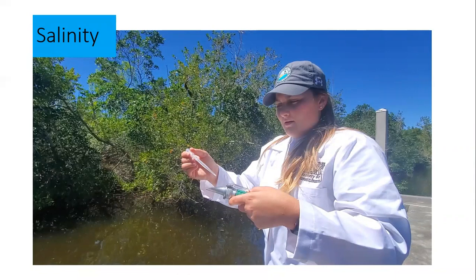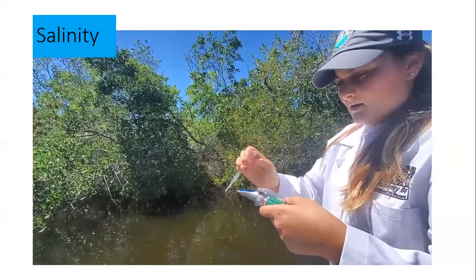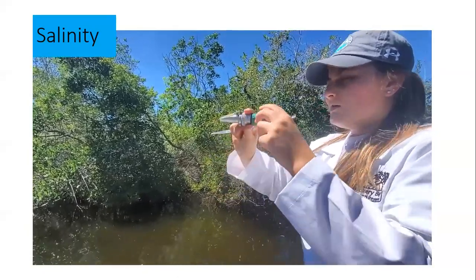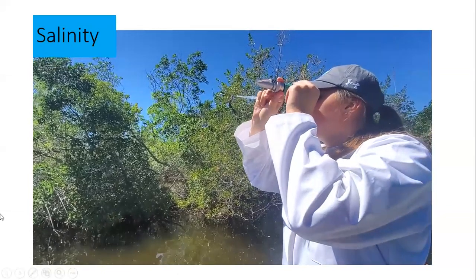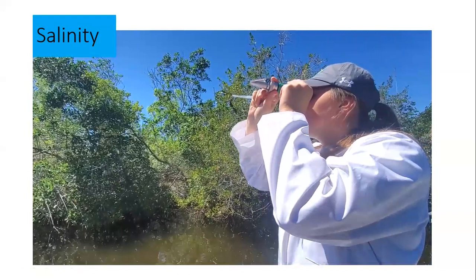So in the summertime, when we're getting all those big rainstorms, our water gets a lot more fresh. In this video, Morgan's demonstrating a refractometer. And how this works is she puts a little bit of water on it, closes the cover, and she's going to be looking for where a blue and white line mix. So this uses light, and depending on how much salt is in the water, the light is going to bend a different amount, and she's going to get a different reading.